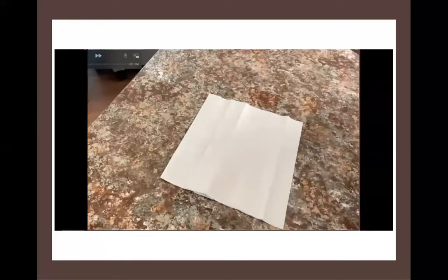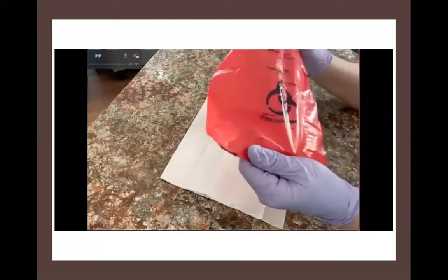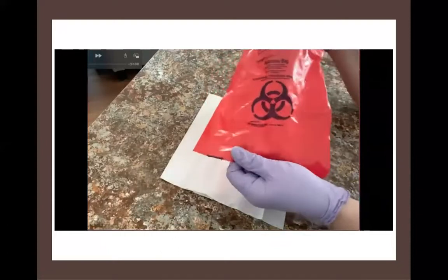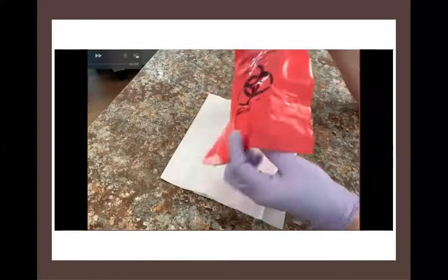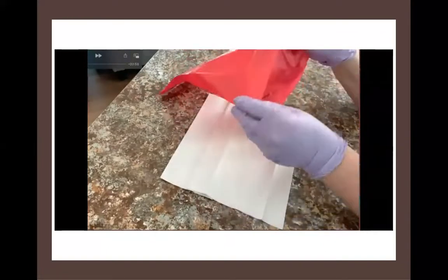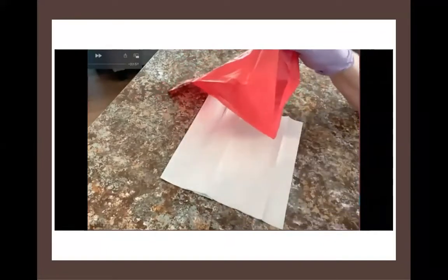At the end of the day, when we've finished our work, it's critical that we know where to dispose of our materials. And of course, when it comes to the materials that touch culture, we need an autoclave bag. This red bag has a biohazard symbol on it, and it clearly says on it, it's an autoclave bag.